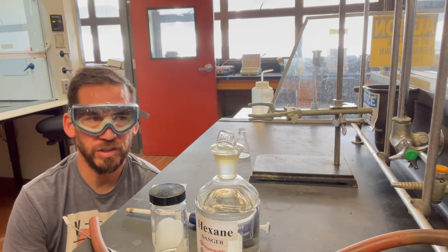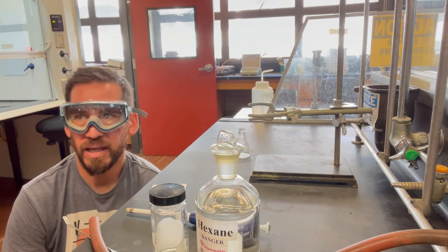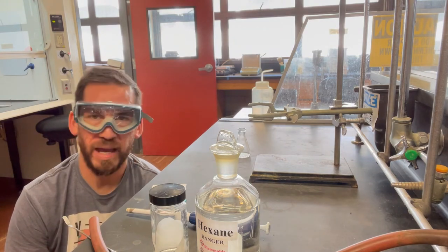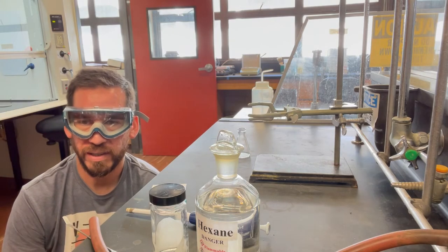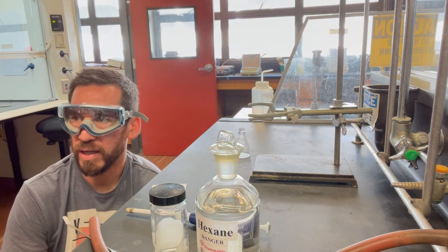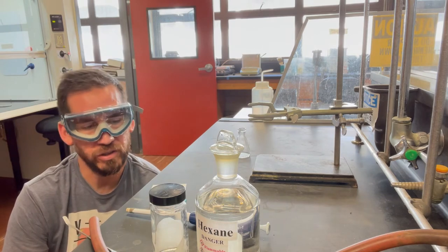But really what we want to do is take some of that sample, run a TLC, and then also run a melting point. So I might just leave it on the vacuum the whole time we're doing the TLC and stuff. So we're running a TLC. I might as well just run the two solids that we got, and then also the filtrate, right? So I have two filtrates too.